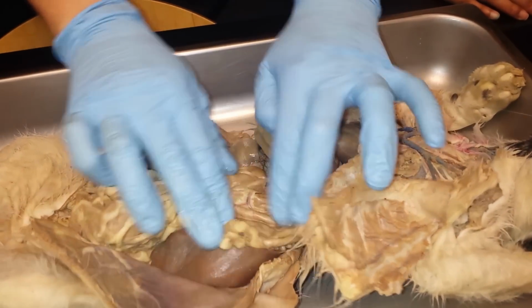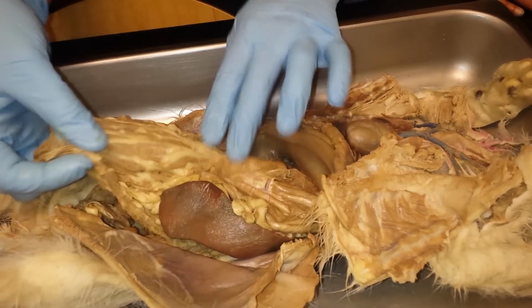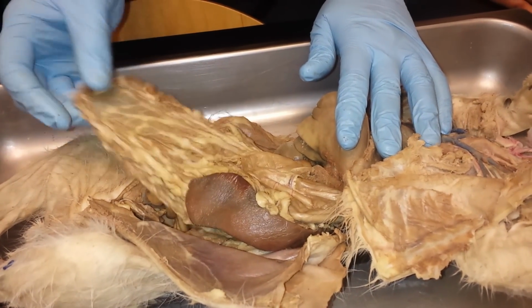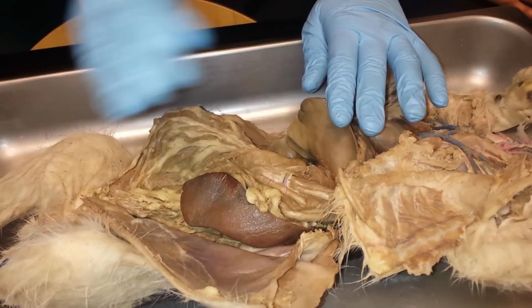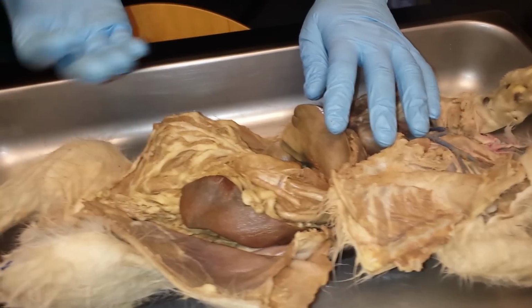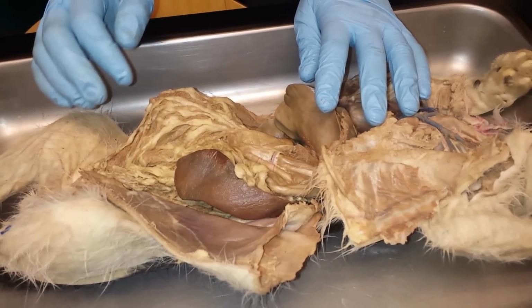So if I lift the liver away, here's the stomach, right? All of this stuff, which is connected to the greater curvature of the stomach, this is all greater omentum. It's that big loose areolar connective tissue and fat, and it lies over the abdominal organs for cushion, protection, energy storage, all of the functions of adipose.